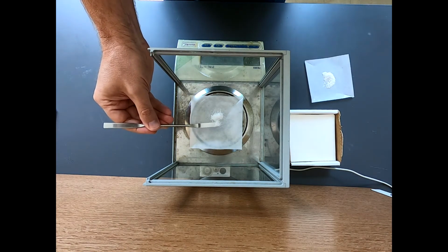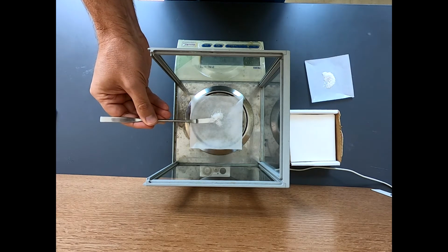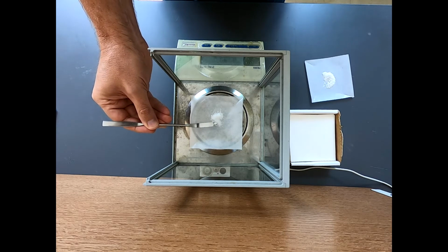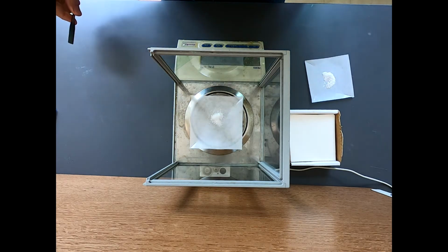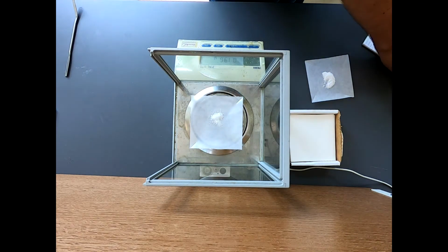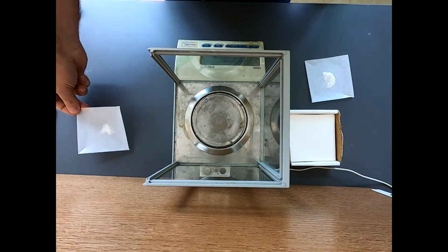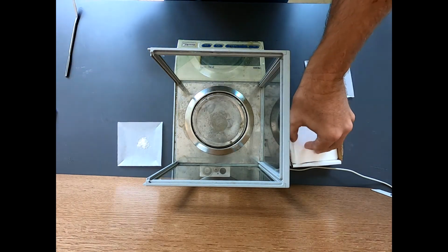Okay, that's 170, 180. Let's go a touch over because I said I want to go over. Okay, I'm being all delicate here. That's fine. That is 196 milligrams. Since I've forgotten this kind of thing, let's write that down. 196 mgs of the cycloadduct. And let's put that aside. Looks very nice. We'll leave it right there. Try not to spill it everywhere.